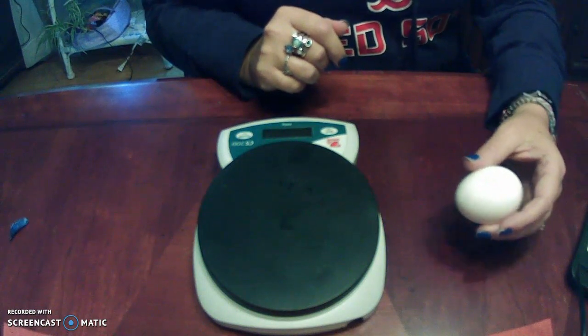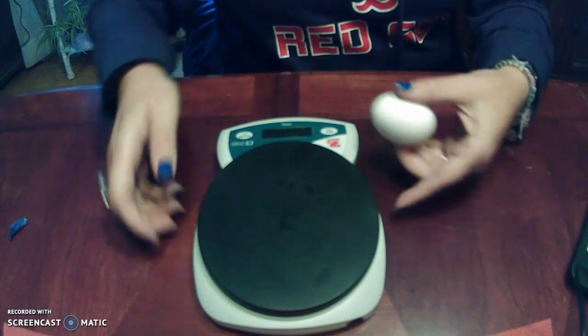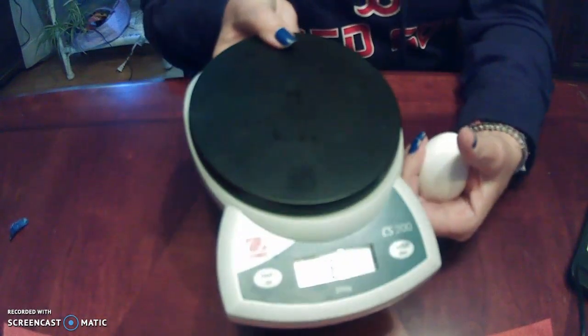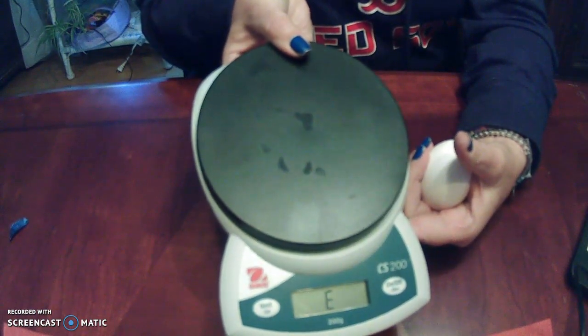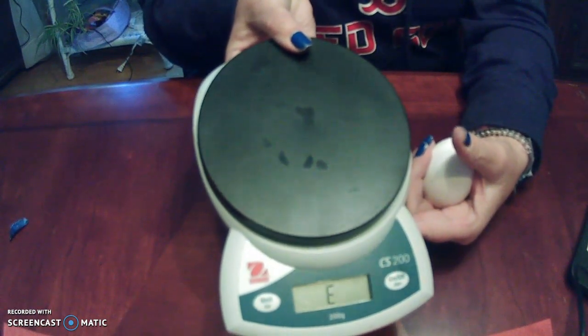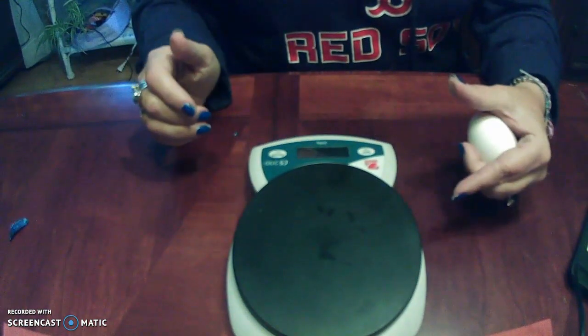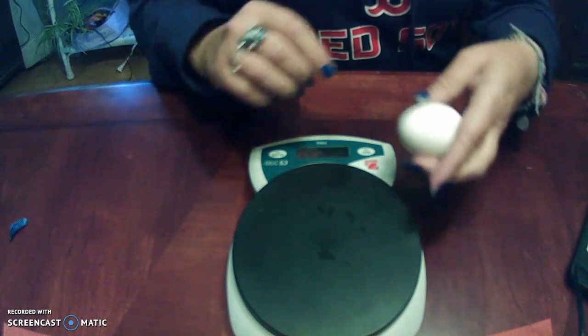So the first thing we do is measure the egg. Okay. So here's our measuring scale. We want to make sure that it's at 0, so I'm going to zero that out. Wait for it to settle. It is zeroed out now, and it is set in G for grams.